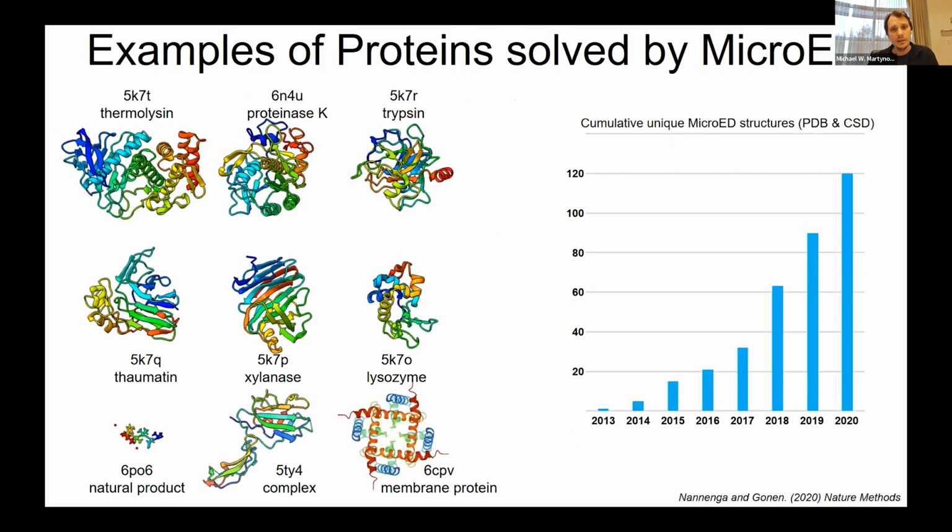As I've said earlier, this is a new technique. Our lab put this out in 2013, and it's been growing ever since in terms of new structures. We had a big breakthrough in 2018 where we showed you could do this for nanocrystals of materials like metals and salts, natural products, pharmaceuticals, anything that's really, really tiny that might not want to grow a big crystal.